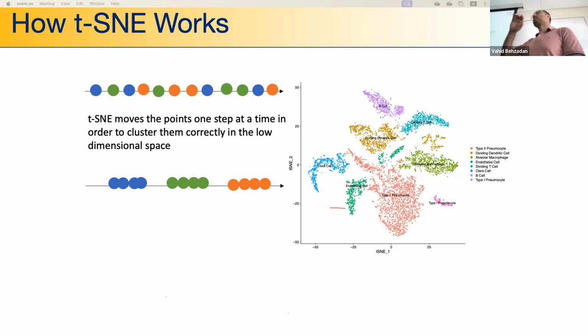I suspect that somewhere in the last few slides that you skipped, you do talk about the transient nature. That's during the pseudo time analysis. Now, in the pseudo time, we have data from different time points. At the beginning, we have data at a single time point, right? But if you want to perform dynamic analysis, you need to collect data at different time points. But that doesn't mean that we assumed a steady state at the beginning. It's just a snapshot in time.